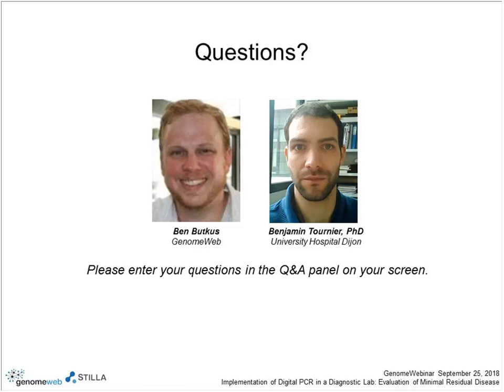Thank you. The next question. Have you looked at whether gentle thawing improves cell-free DNA recovery? In fact, it's rather a recommendation.